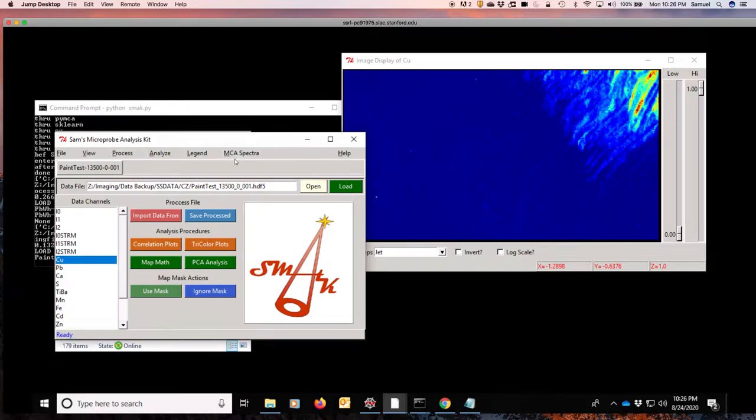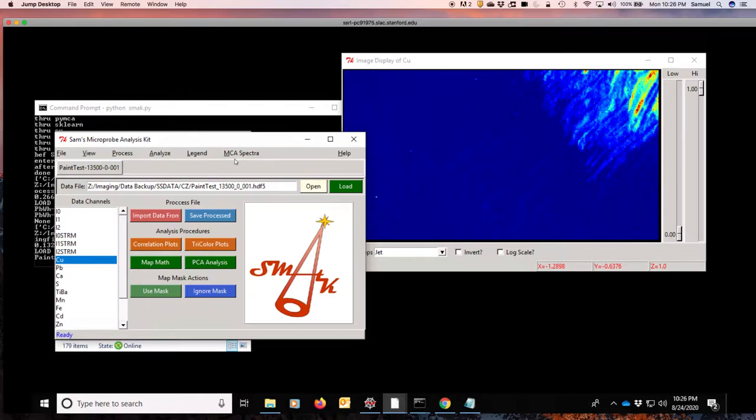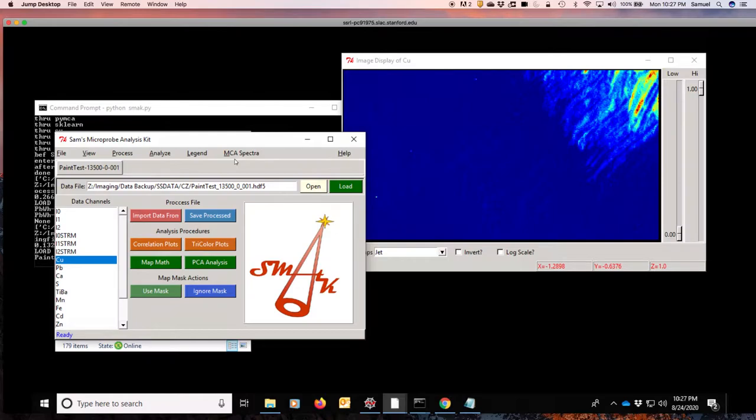So the first thing we need to do is take the raw spectra that we have. In the same way that we have the MCA spectra for every line, we also have a very similar HDF file for every UV-visible spectrum for every line. And we need to assemble that into a single file.